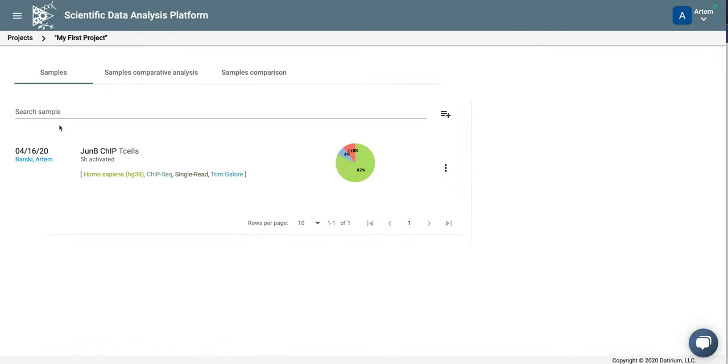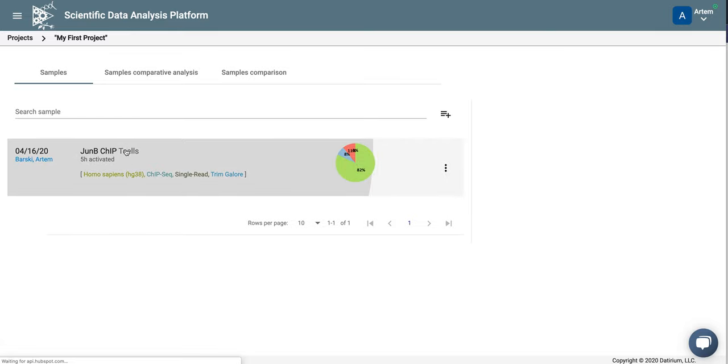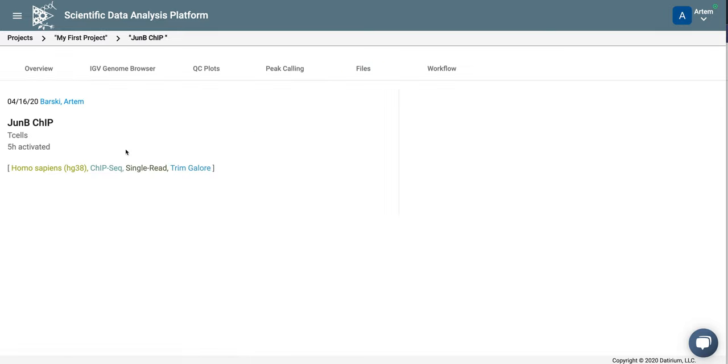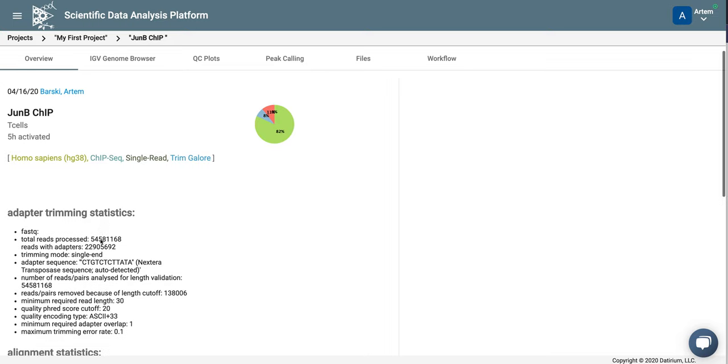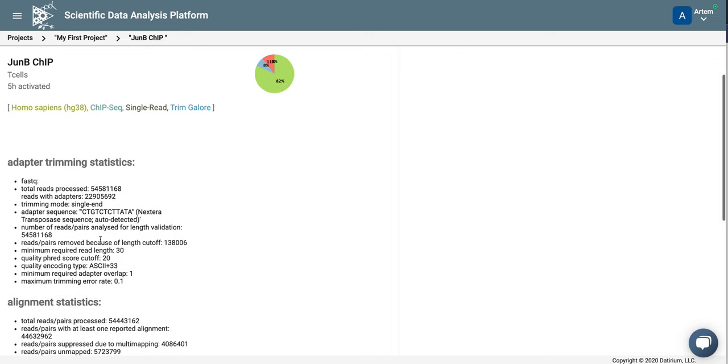So we're going into our project. This is our ChIP-seq sample. This is JunB ChIP-seq in activated T-cells. You can see here is the pie chart that shows percentage of the reads that got aligned. Here you can see the statistics more detailed. You can see 82% of the reads got aligned. This is good.